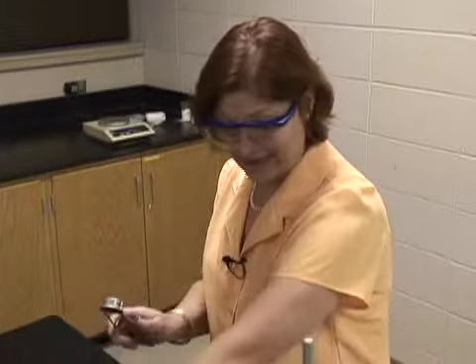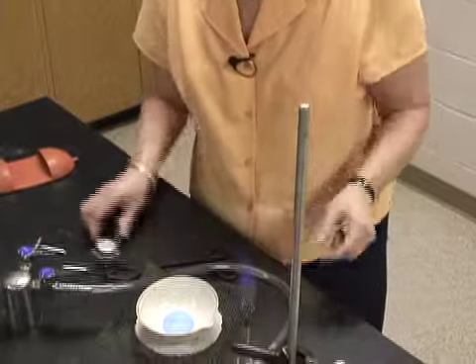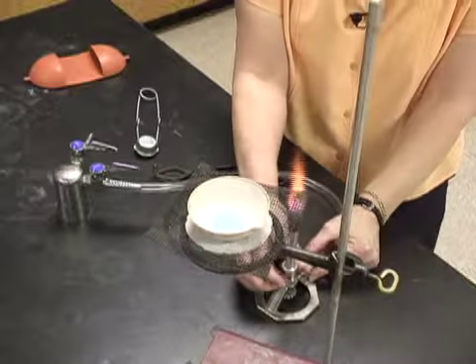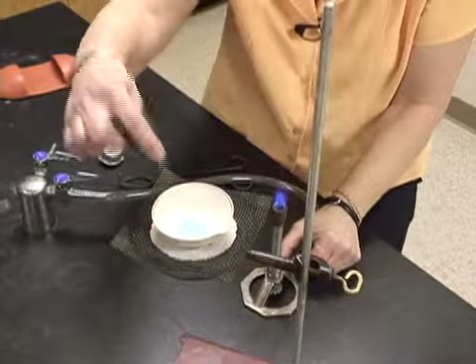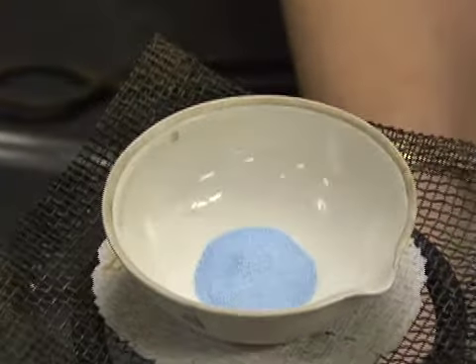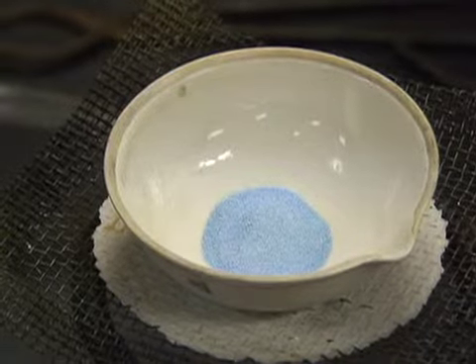Now, I'm going to light the Bunsen burner. I take my striker, I turn on the gas, and get some spark going, and there she goes. Now, I think I want a little bit higher flame, because I'm always impatient. Did you see that beautiful color of that crystal? Well, we're going to drive off all that water from that hydrated crystal.